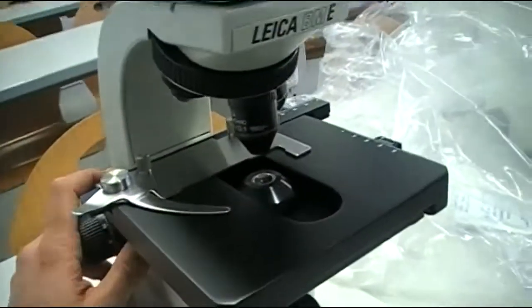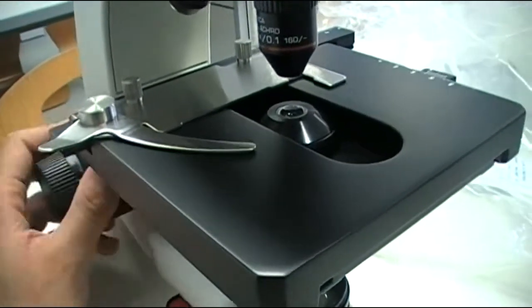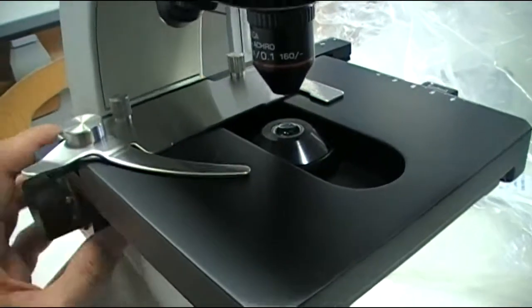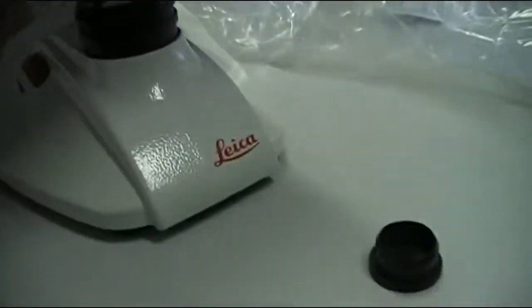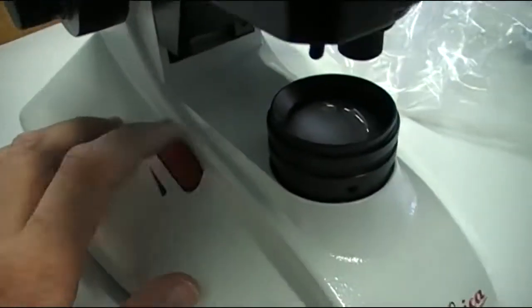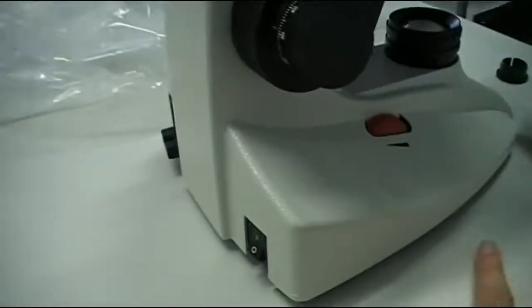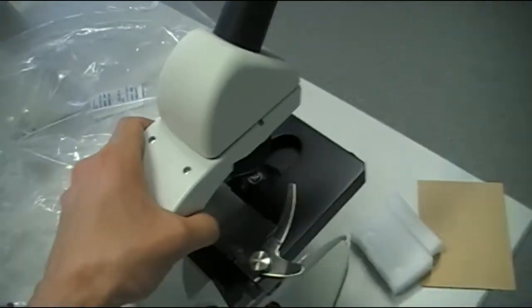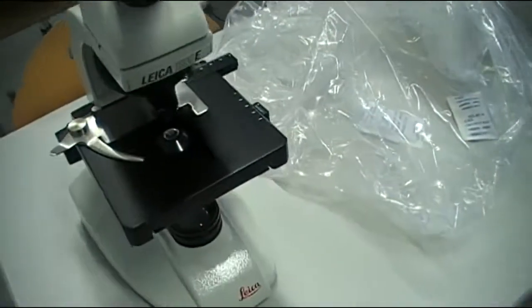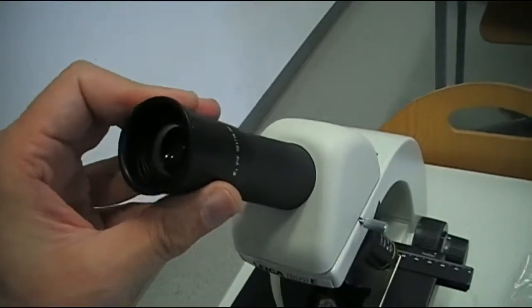Now the coarse focus adjustment knob — interesting, does not go all the way up, which is good. I'm quite enthusiastic about this one I have to admit. Here we have the dimmer — the light intensity adjustment. Where's the main switch? The main switch is here in the back. Nice and solidly made microscope, should last another 30 years.